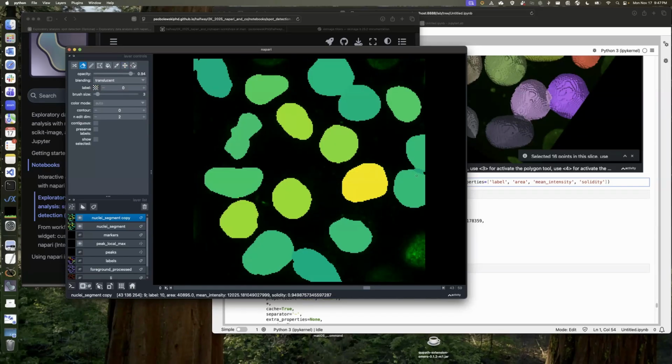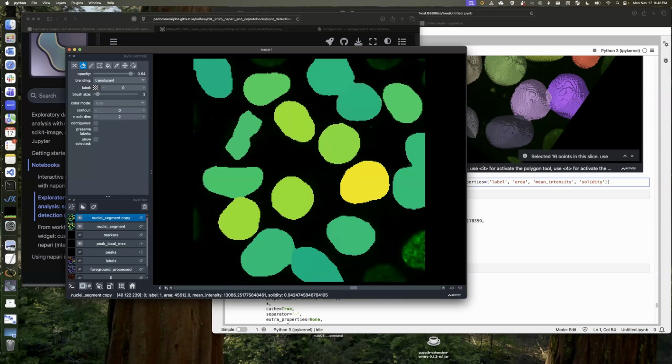I suspect this is what we should be doing. I think because I messed with the color map, that things are going to be, yeah, because I changed the color map. I don't think I really wanted to do that. But you can use the eraser to do that. So that's option one. But then you'd have to do it on every single slice, right? So you'd have to erase here, right? And so on and so forth.